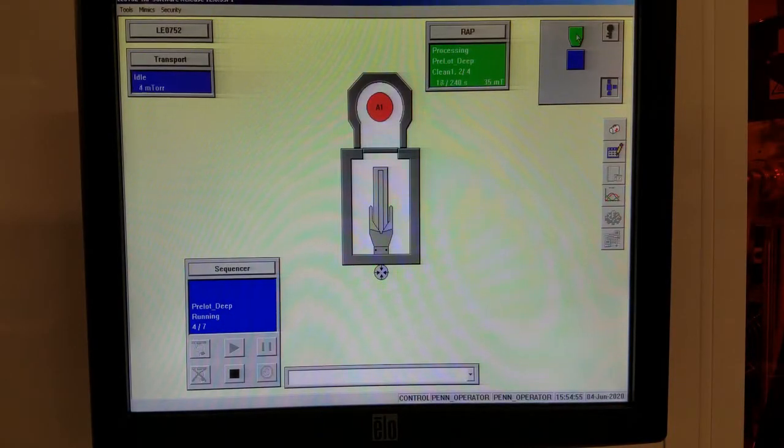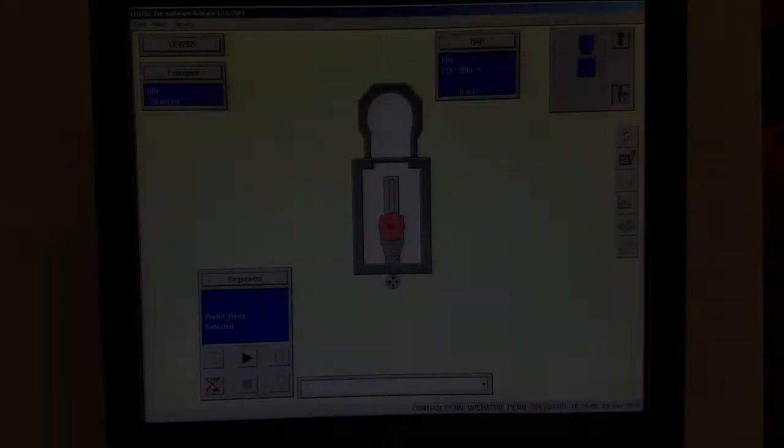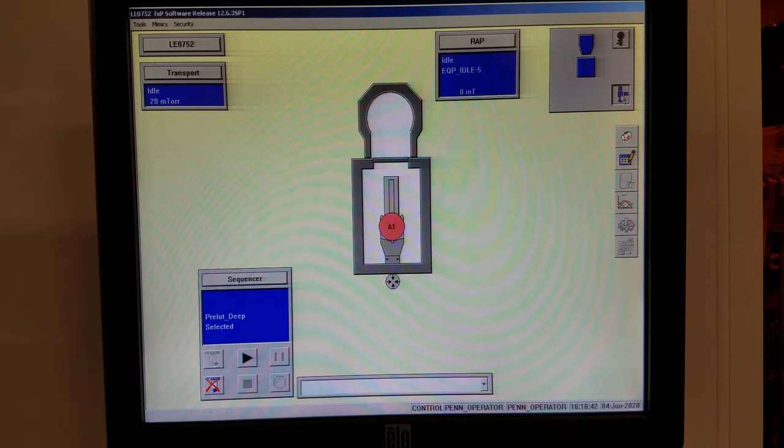If you click here, this will show you what the tool is doing inside the process chamber. You can see which step it's on, gas flow rates, and so much more. We'll have a few minutes before we can run our process, so let's take this time to set it up.